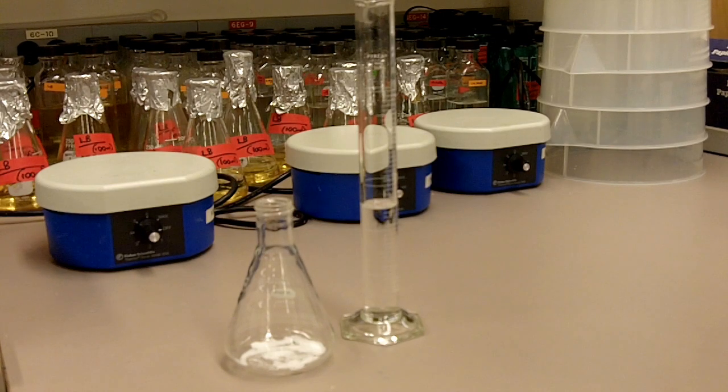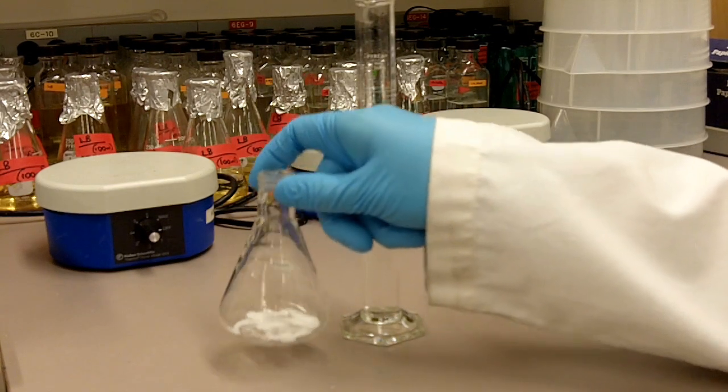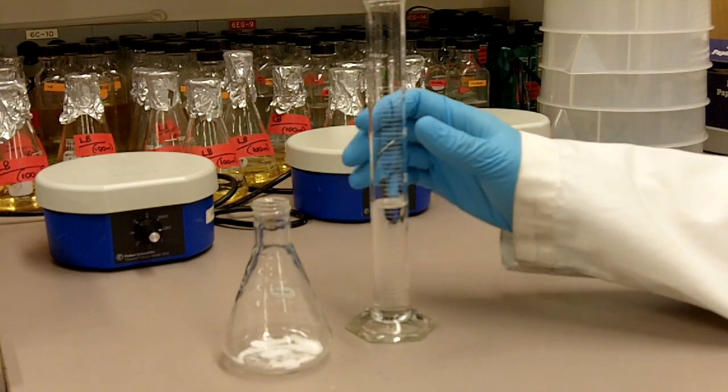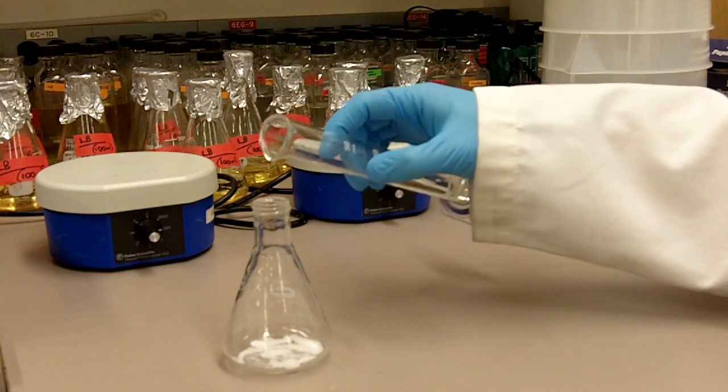To make 25 ml of 1% gel, I have already weighed out 0.25g of agarose and 25 ml of TBE buffer so we'll just add the TBE buffer to the agarose right now.